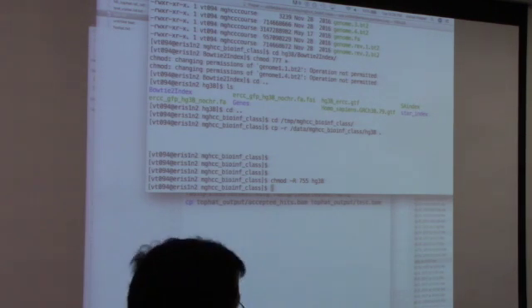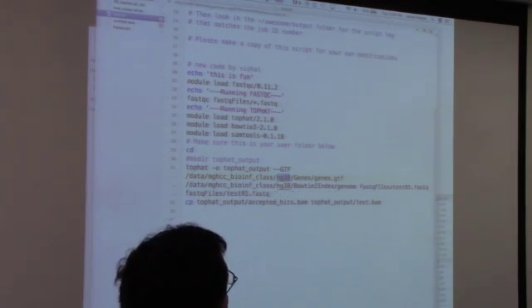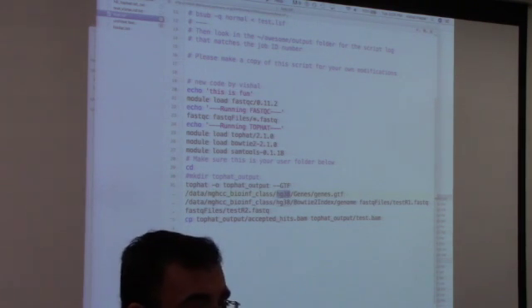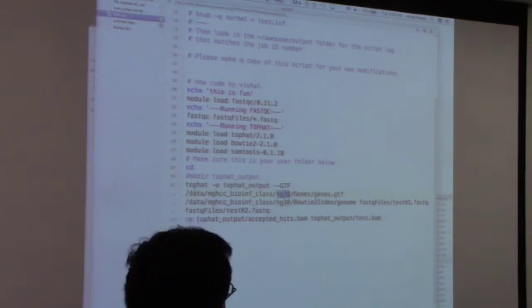In the meantime, come on guys, we've got to finish this, and I have to go over the other stuff too. Tomorrow we're not going to have a practical, so this is why I'm doing this today, because tomorrow it's really just 2 lines, so you have to do this. But let me show you what else you have to do. Alright, so once you copy this here, what are we going to change this to?